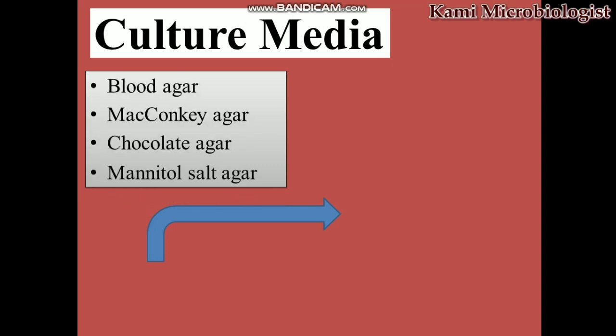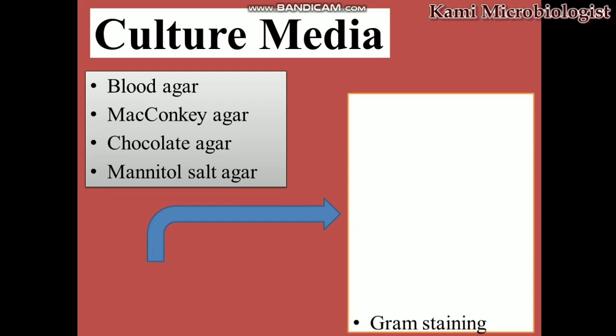Culture media. For the throat swab for C&S, we use blood agar, MacConkey agar, chocolate agar, and MSA, mannitol salt agar.